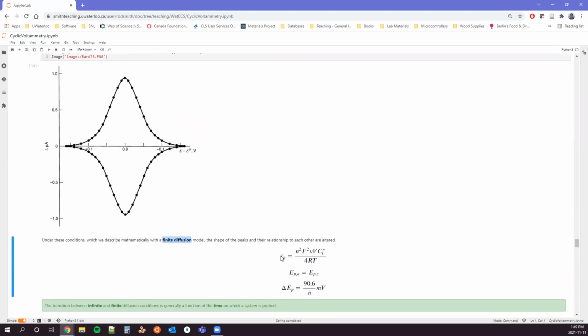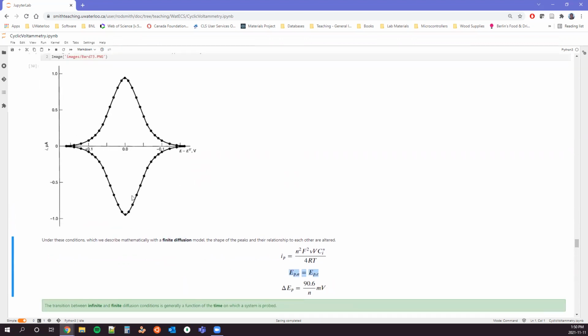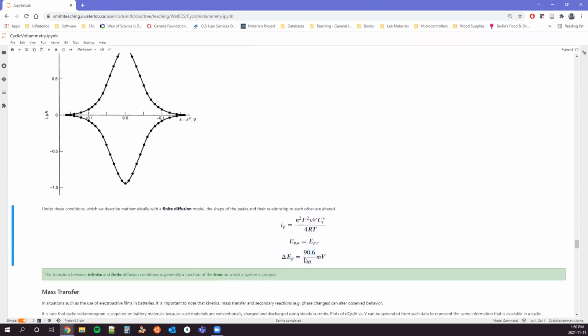And so we have to change away from that semi-infinite diffusion and move over towards a finite diffusion model. When we adjust the math to do that, we change the characteristics that we expect to see. And so for a reversible couple like this, for our peak value, we have this new equation. Notice that the D value is completely gone. There's no diffusion factoring in. Our EPA and EPC are now stacked on top of each other, which would be our E1/2 in the other situation, right? And so this would approximate our formal potential. And then we have the peak width. What we're looking at here is essentially the full width at half maximum. And so again, it's going to be a function of the number of electrons transferred.